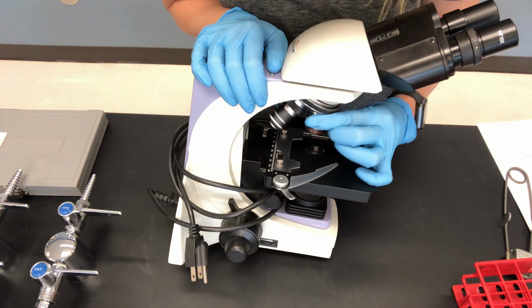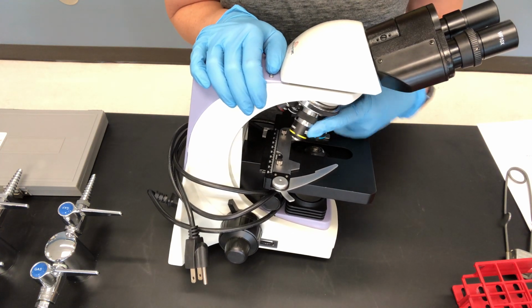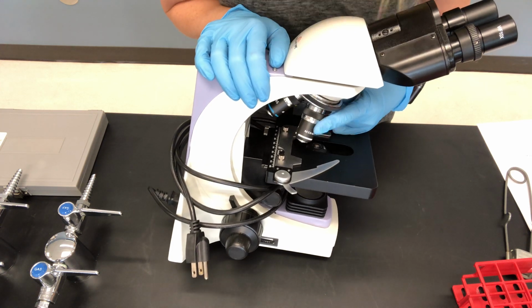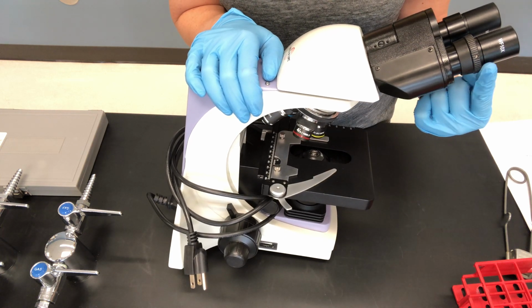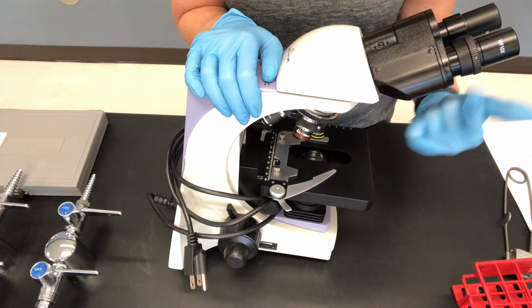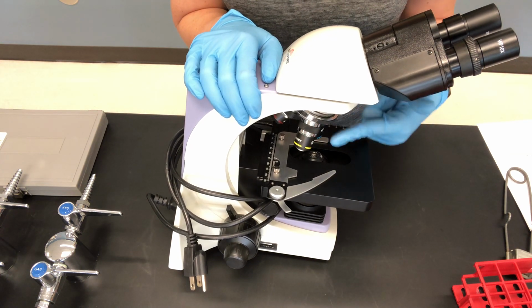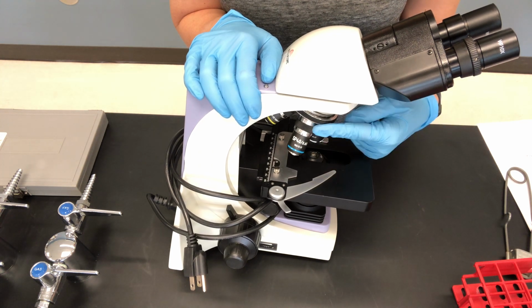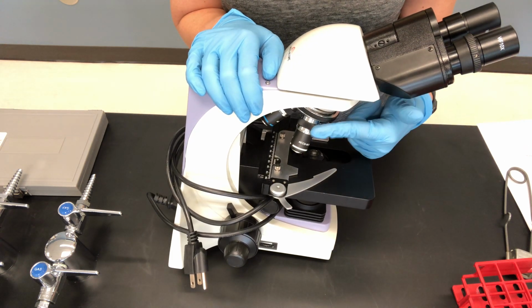And then our objectives have our scanning power is 4x. Our low power is 10x. Our high dry power is 40x. And our oil immersion is 100x. So to get total magnification, you just multiply your 10x eyepiece times your objective. So our lowest magnification on scanning will be 10 times 4, which is 40. Our low power is 10 times 10, which is 100. Our high dry power is 10 times 40, which is 400. And our oil immersion is 100, so 10 times 100 is 1,000.